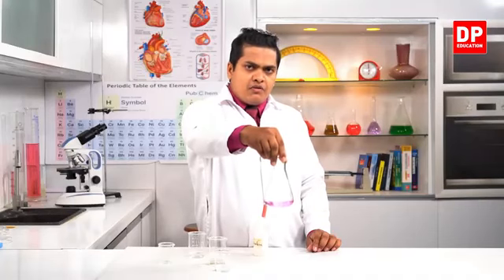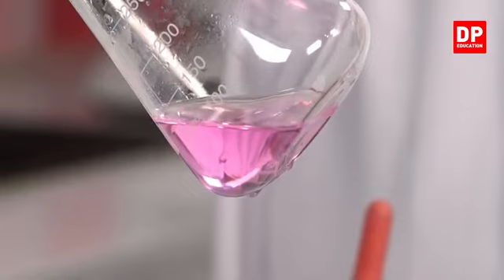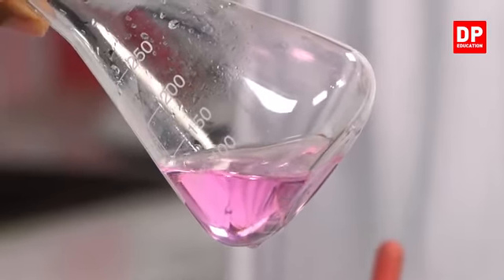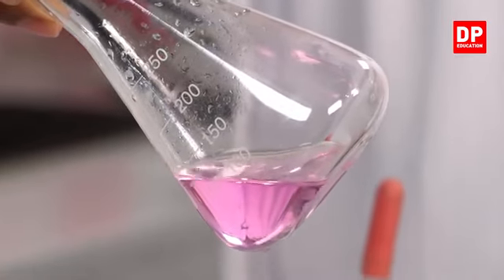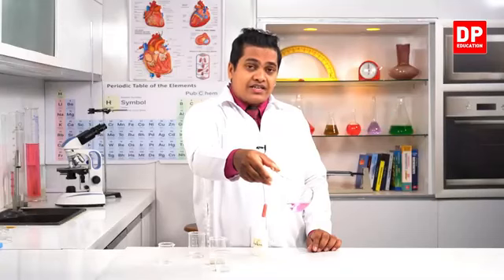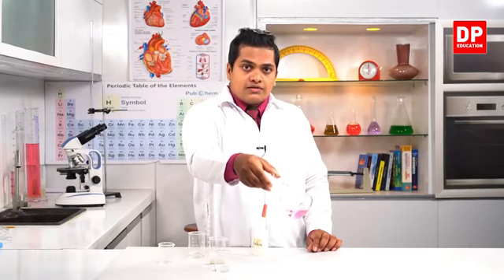It still has some basic nature, as it has some pinkish color. So when adding acid to this sodium hydroxide solution, you can observe the color is dramatically changing into the initial color of the sodium hydroxide solution, which was colorless, right?